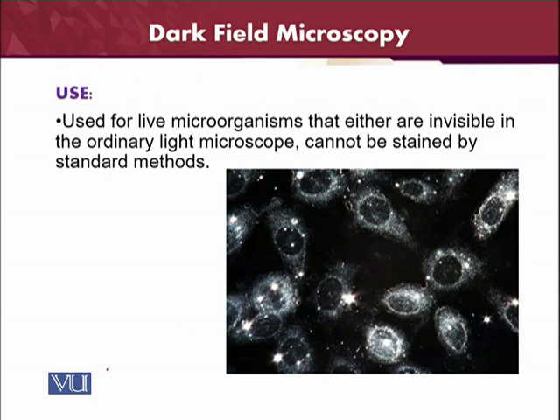It is used for live microorganisms that either are invisible in the ordinary light microscope, or that cannot be stained by the standard staining methods. So here you can see the purpose of the dark field microscopy.